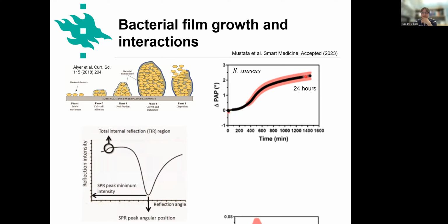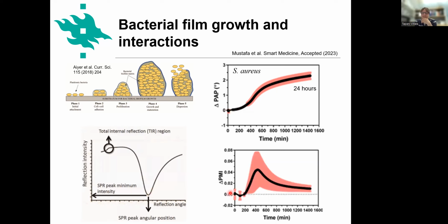When we then use this intensity data, we saw actually that, okay, we have a delay time here, but at a certain point, this intensity starts to grow. And exactly at the point where we have steepest slope here, it then turns around and then it goes down and comes almost back to the zero level.